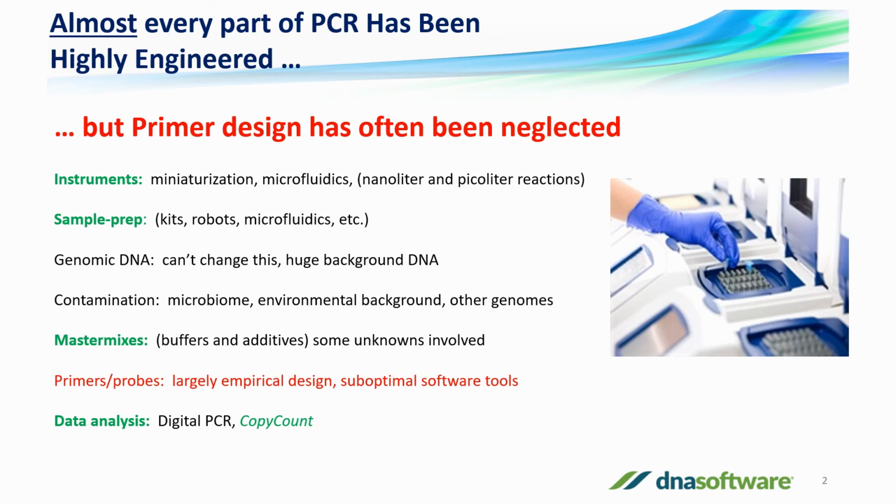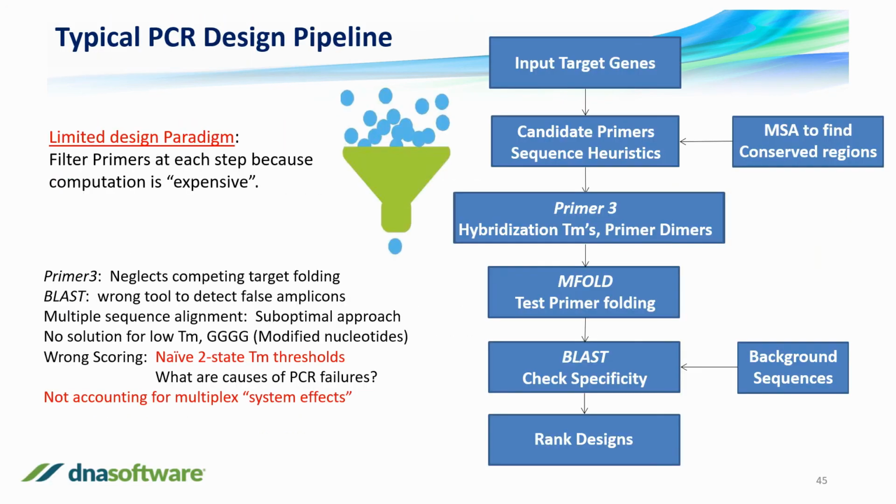And we've done exactly that at DNA Software to try to understand the causes of failures of PCR. Now, many researchers, not knowing how to design PCR, will put forth the effort to combine various free software into a PCR design pipeline, which is shown here.